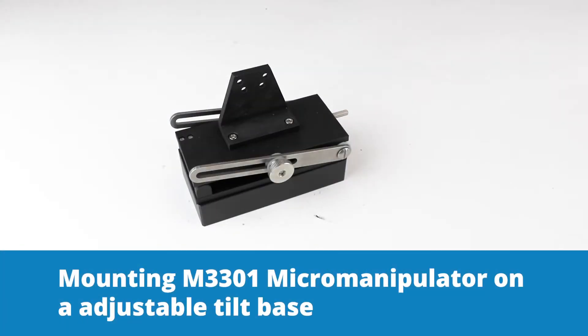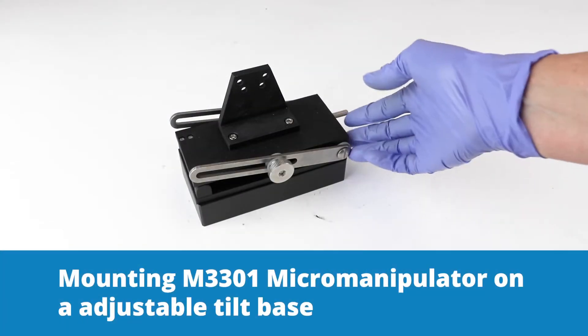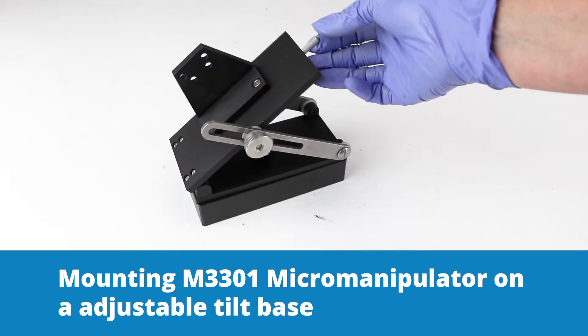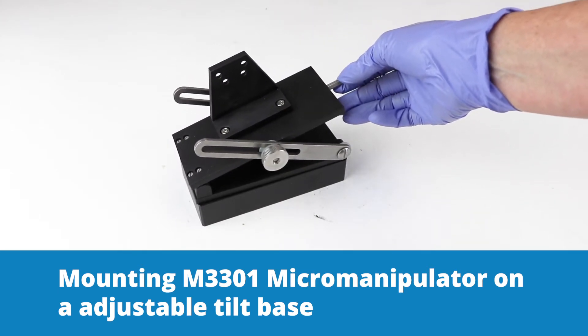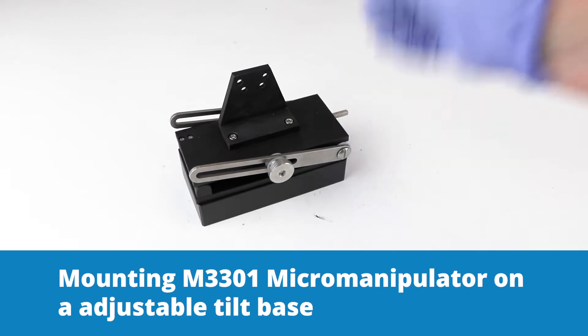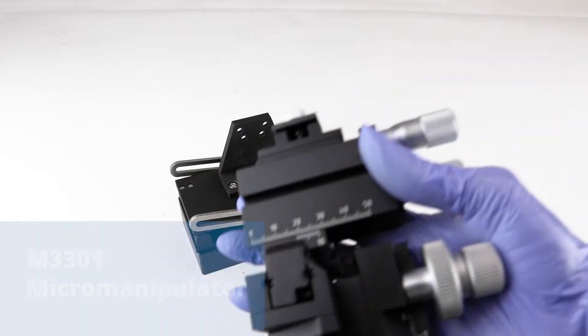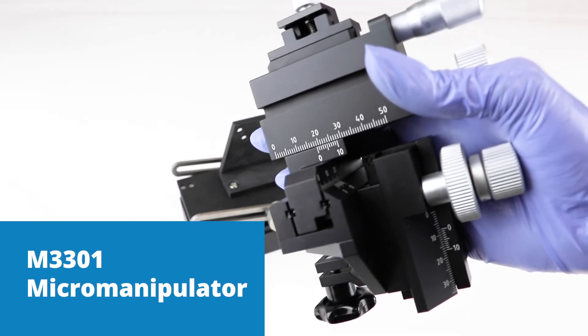Today we're going to mount a micromanipulator on this tilt base, which can be adjusted to position the micromanipulator right where you want it. We're going to use our popular M3301 micromanipulator here.